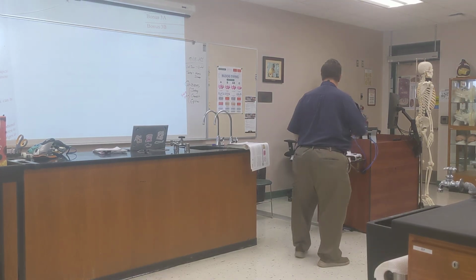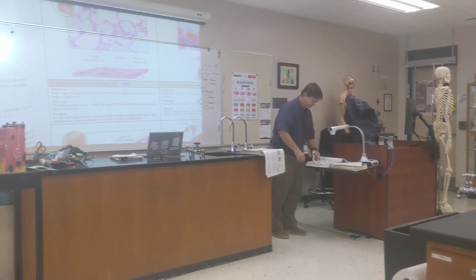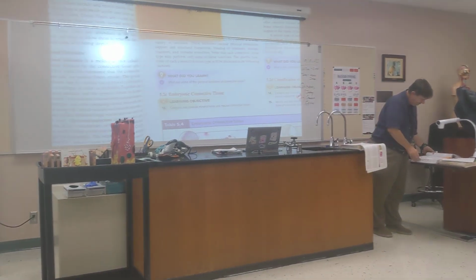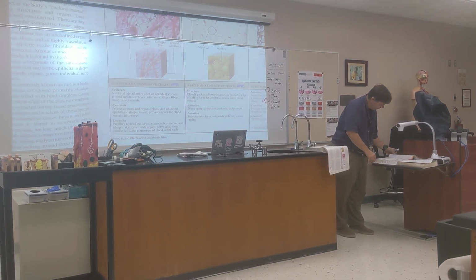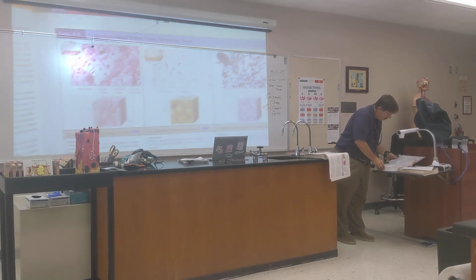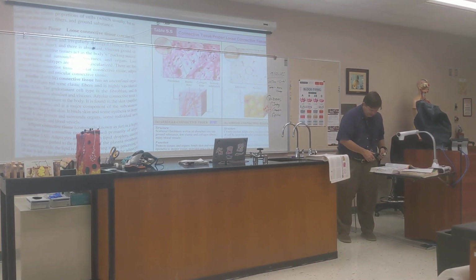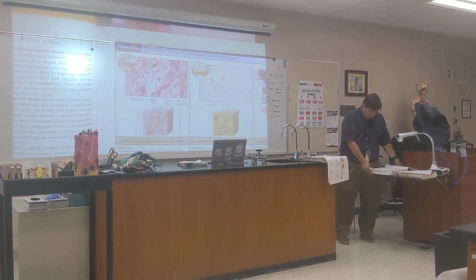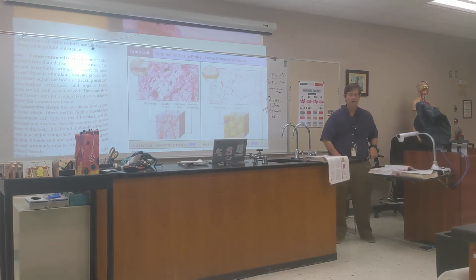Some of them, and I'm going to go to pictures right now to show you some of them, we'll move on. Okay? So, if we're looking here, that's mesenchyme. We don't care about that. We're not testing on that. Okay, so connective tissue proper. Here we're going to have areolar tissue. This is in your textbook because there are better pictures than in your lab. This is in your textbook on page 169. I would recommend writing that down in your notes so it's easy to get to.